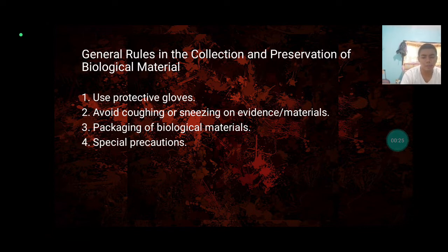First, use protective gloves. It is really important to avoid touching individual smears and traces, and to remember that gloves can entail a risk of contamination. Change gloves when handling each kind of material, and otherwise as necessary. Use disposable equipment for preliminary tests and collection of trace evidence, and cover the surface where the materials are placed with protective paper to keep the victim's and suspect's clothes separate. Next, avoid coughing and sneezing on evidence and materials.